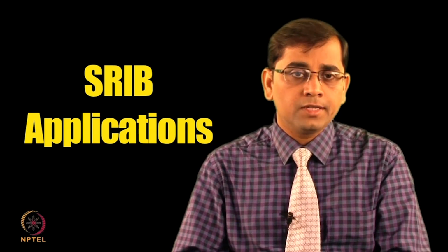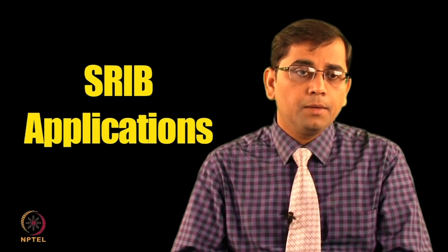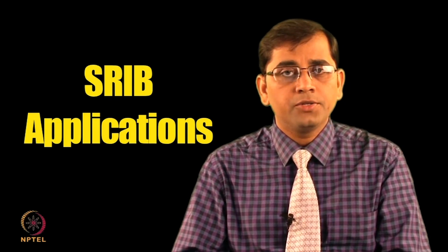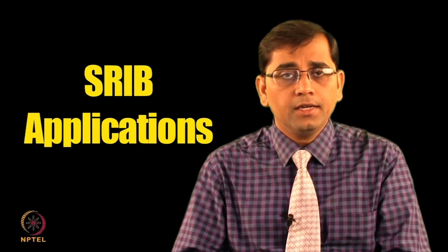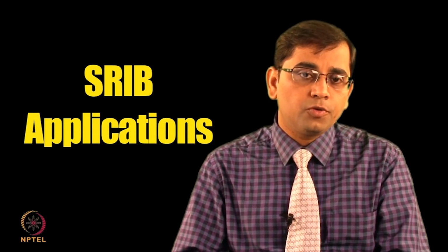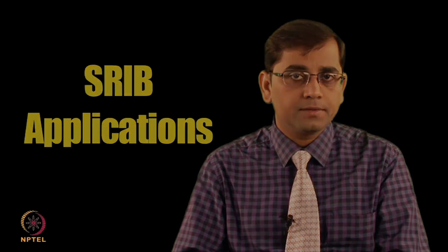The simplicity of the system, its high sensitivity and compatibility with glass surface chemistries make it a very promising platform for multiplexed detection of different biological analytes in complex samples with critical impact in research and diagnostic applications.